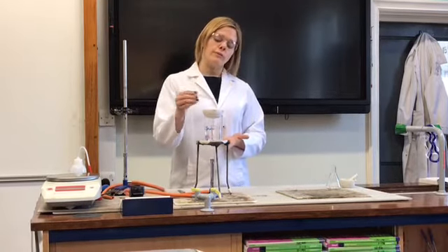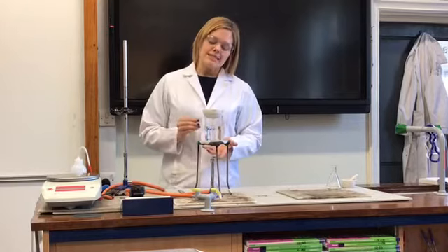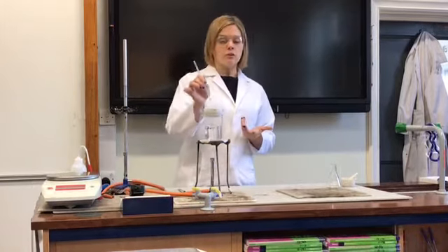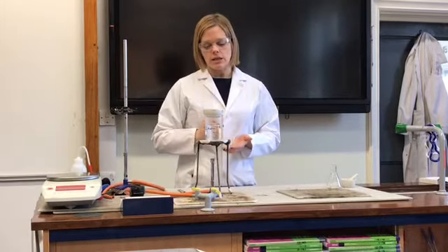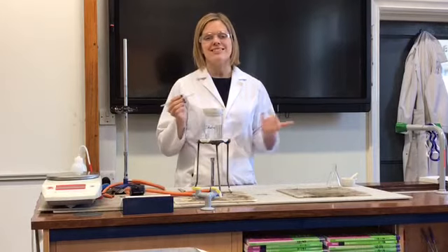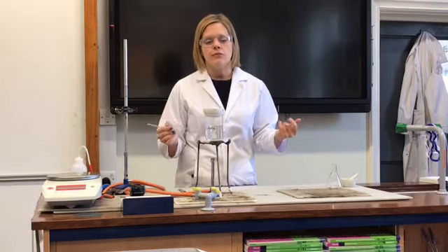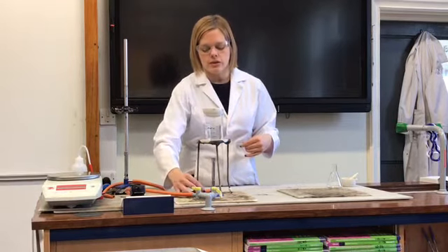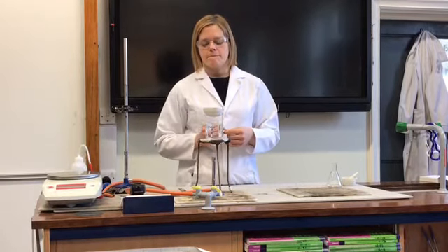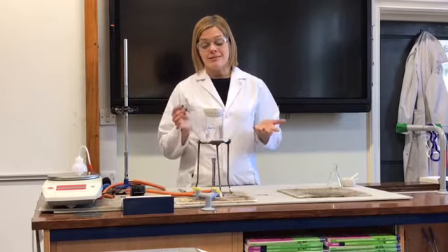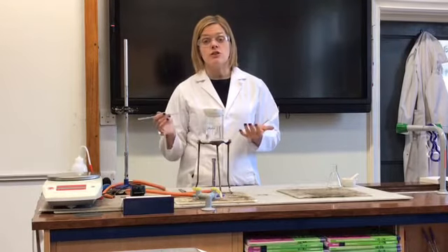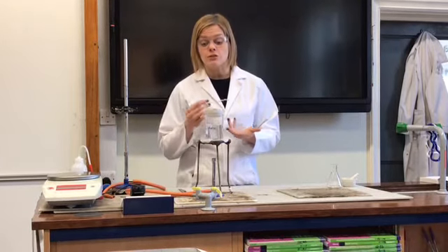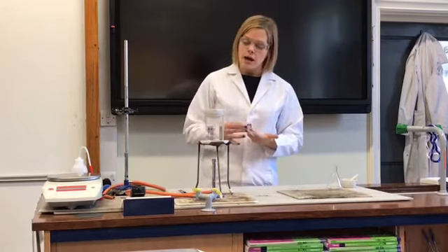So the first idea is we don't wish to evaporate all of the water inside here. What I would very much like to do is create a saturated solution. If you refer back to the definitions, remind yourself what a saturated solution is. A saturated solution is a solution in which no more solute can dissolve in that mass of solvent at that particular temperature.